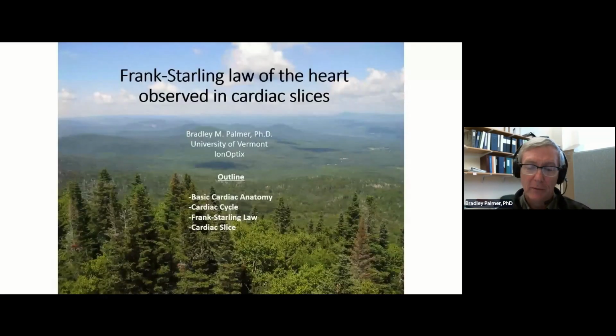Welcome to today's webinar. I'd like to present to you our use of an experimental model system called the cardiac slice and demonstrate to you that the cardiac slice can be used to mimic the cardiac cycle and in particular the Frank-Starling law of the heart.